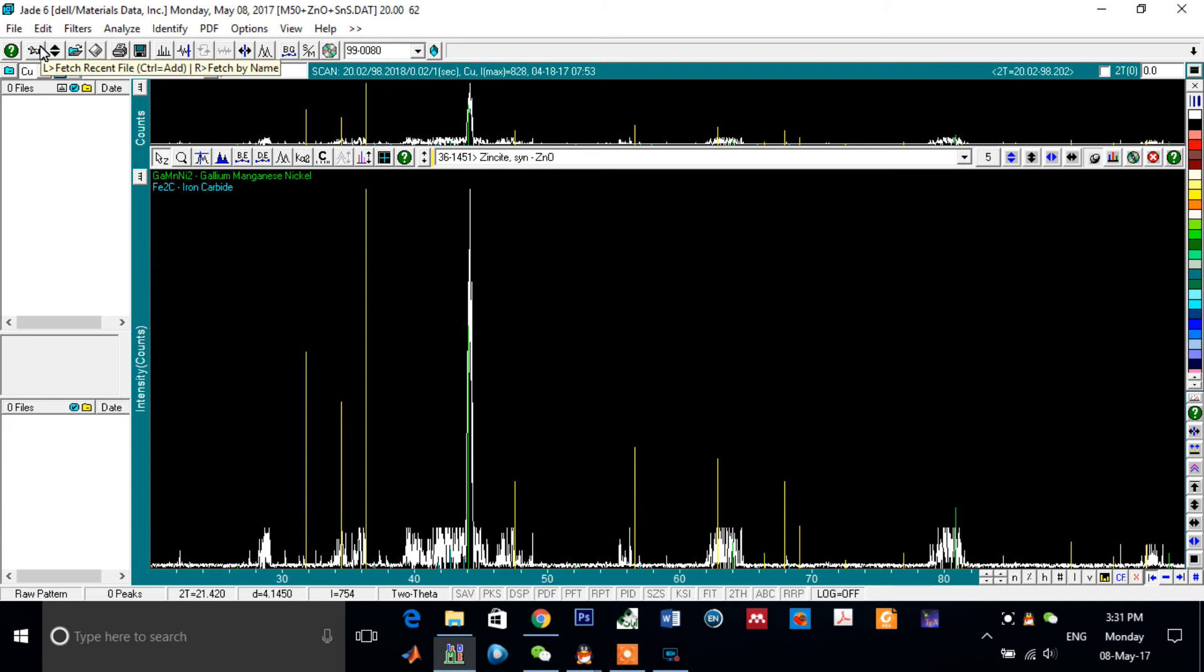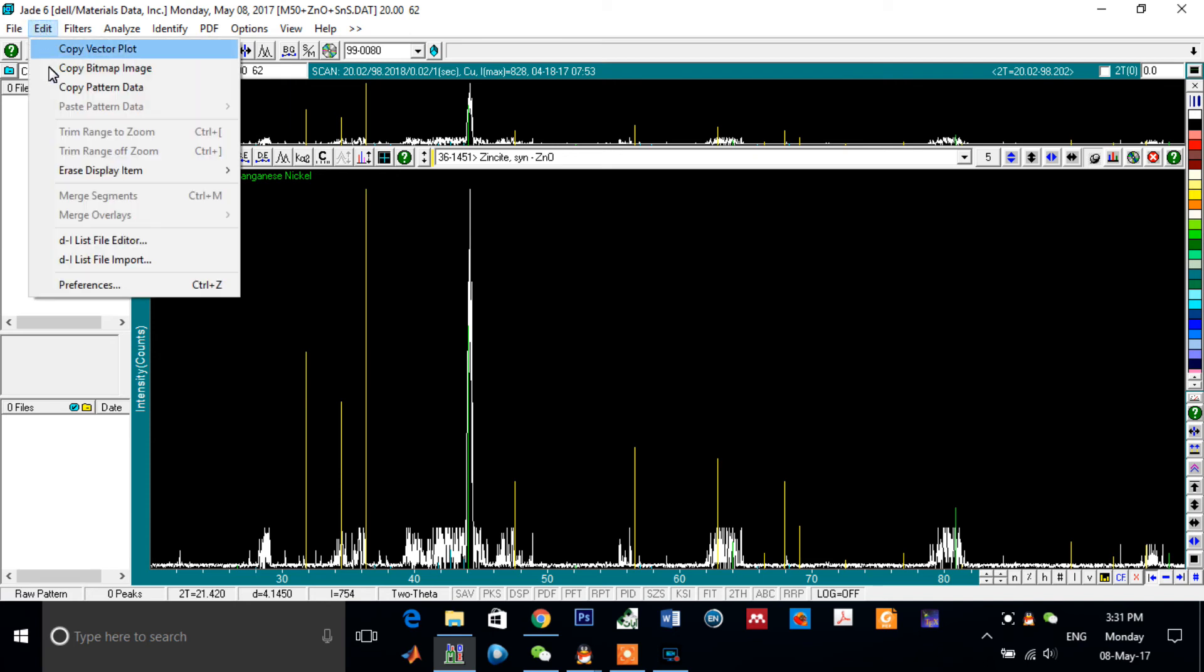Click on Edit and copy the pattern data.